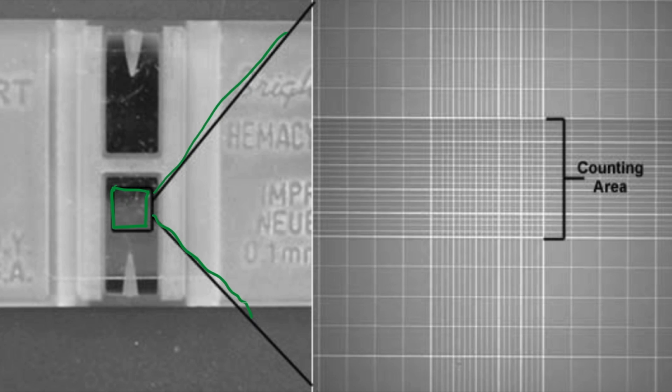We'll go into that. But before that, what I want to focus on especially is this V groove that you see on both sides. What that does is it allows you to place the tip of the pipette right there, so that the sample can be loaded into these chambers. Typically about 15 microliters is used, but obviously it varies with the different sizes of these hemocytometers, and from vendor to vendor.